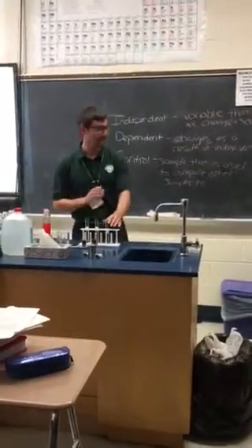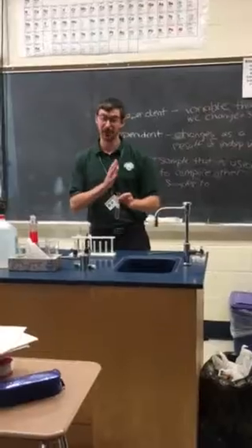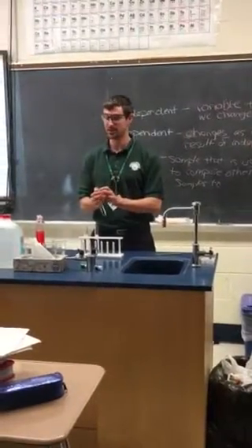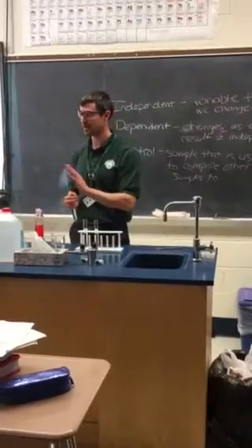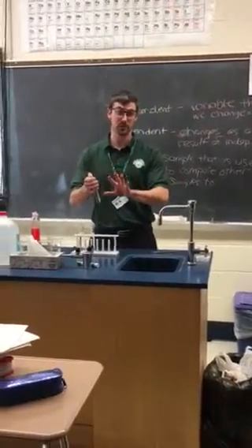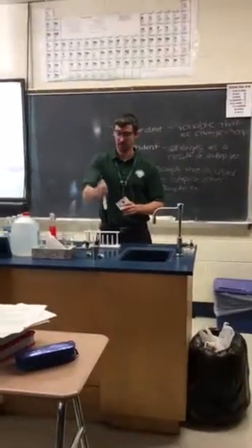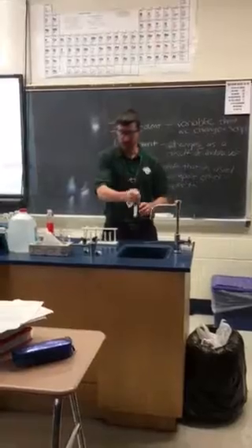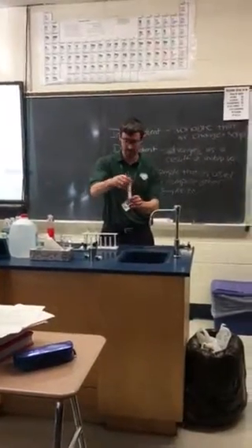And so this is where it gets interesting, because you can divvy up the responsibilities between the 3 people in your group. So each person can take one test tube and vigorously shake until you see suds. So it's probably gonna be about 10 seconds. There's sinks over there in case there's a spill. There's paper towels nearby. And so you're shaking because you want to produce as much suds as possible, right? It's a good thing. And so you're shaking. 1, 2, I'm already spilling a little bit. You try to contain as much as you can. All right, it's about 10 seconds.